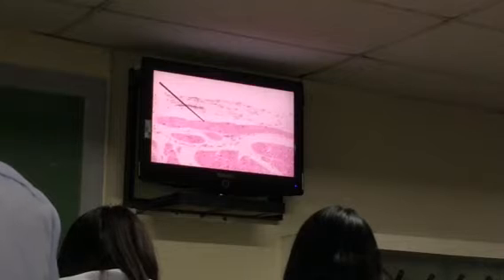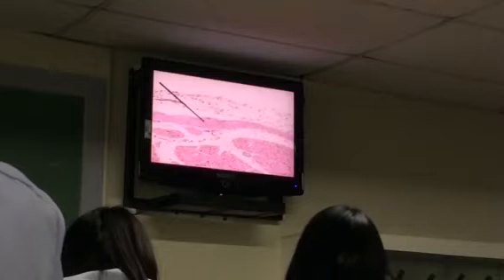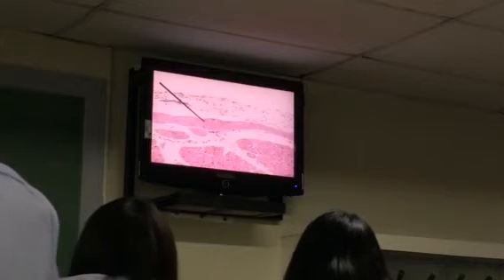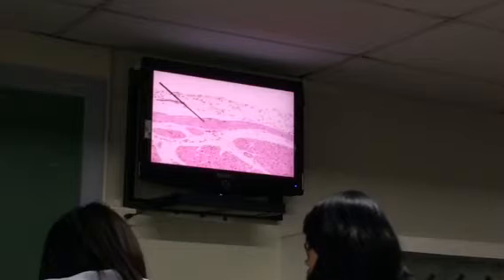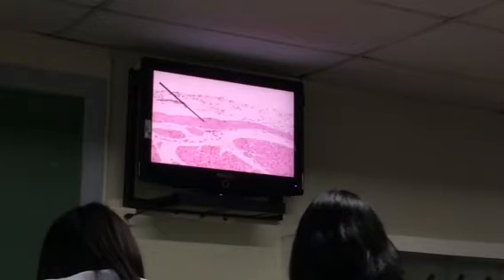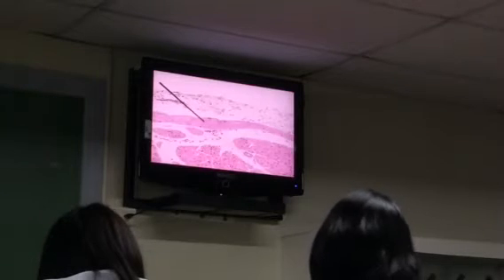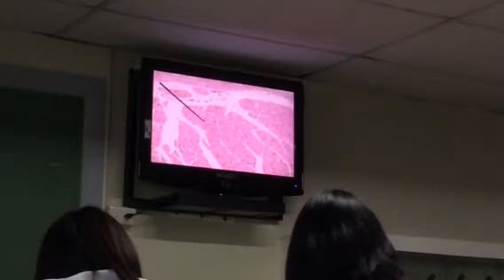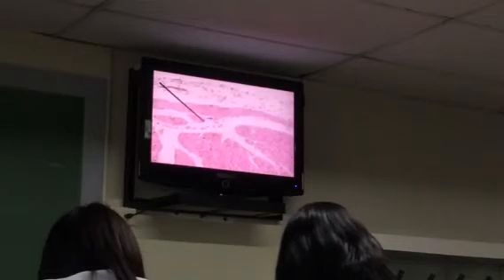O yung conducting system of the heart, ano yung mga yon? Diba? Yung mga SA nodes, AV nodes. Specifically, this structure, yung structure na yan, this is your Purkinje fiber or your Purkinje cell. You had already your lecture with Dr. Bartelosa. You differentiate your cardiac muscle cell. This is also a cardiac muscle cell, but this is specialized for conduction. Well, this one is the cardiac muscle cell specialized for contraction. So, titignan nyo ulit yung kanilang differences.